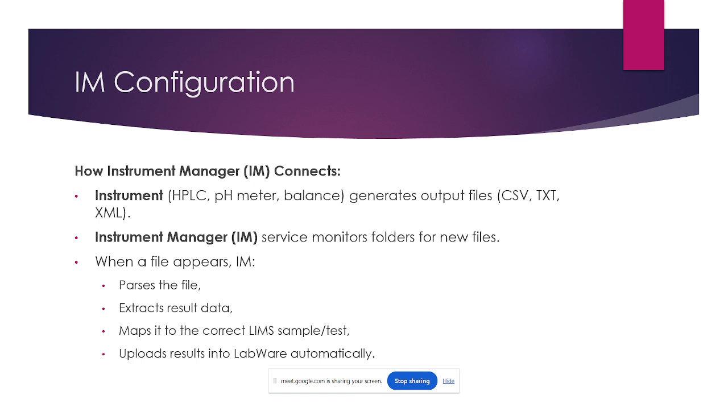I'm not explaining SAP and all; SAP will be a different case. Lab applications, for example HPLC, pH meter, or balance, whatever it may be, we need to create one parsing script. Once we create the parser, we can extract the result from the application.